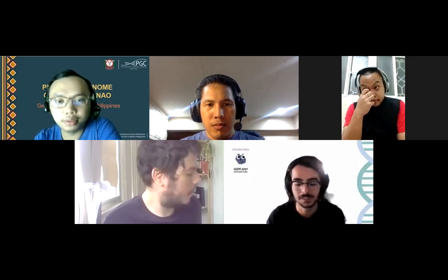Yeah, hi, my name is Almir. I'm from Brazil too, like Isaac, and I'm part of the Friendzymes team, helping in a lot of ways. Our team wants to do nanopore sequencing for confirming our constructs. We need to know that everything is in the right place. We use the MinION, that's the most frugal sequencer to use, so it's a very good piece of equipment to have. We want to use it to confirm our plasmids and see if everything is all right, sometime in the future when we do the constructs.